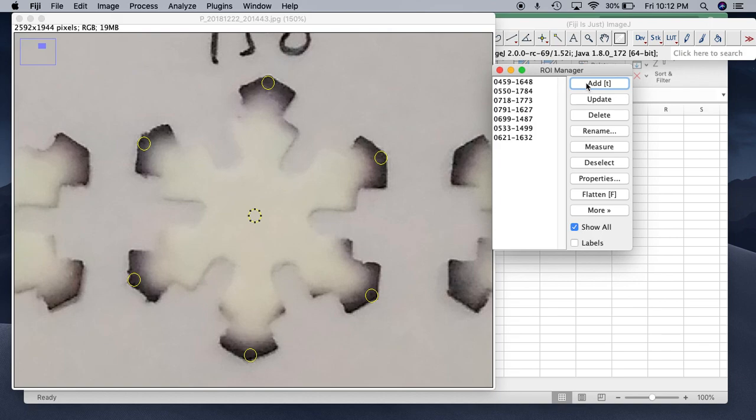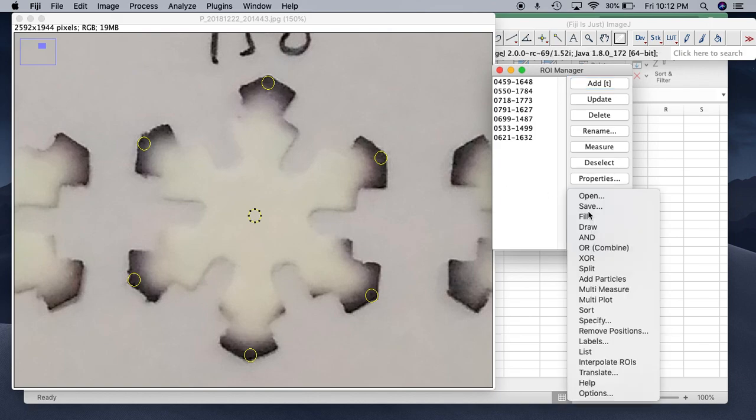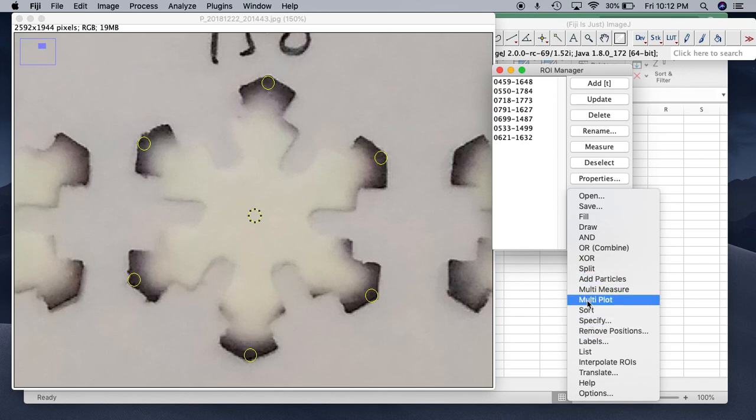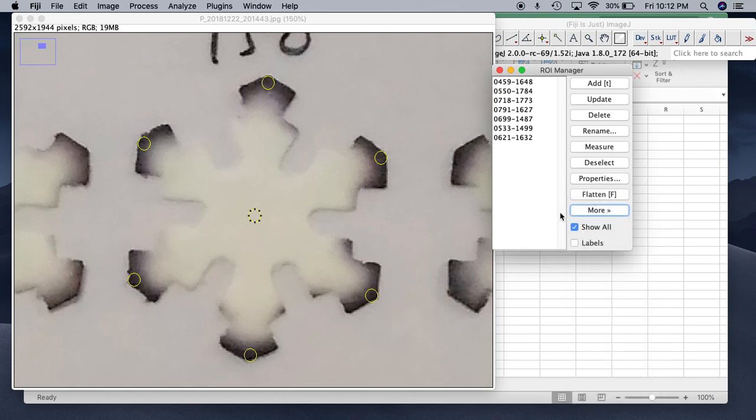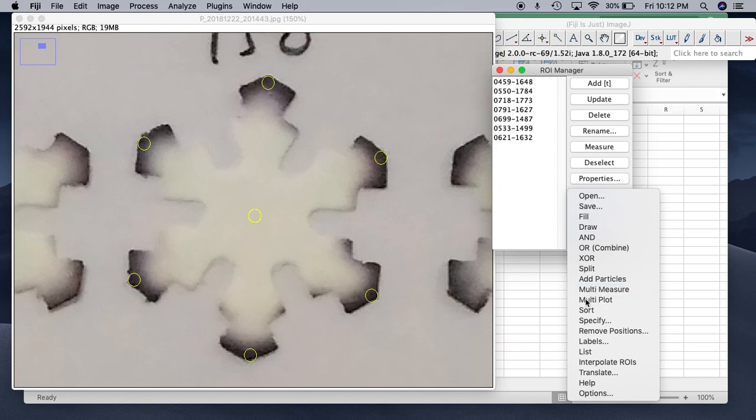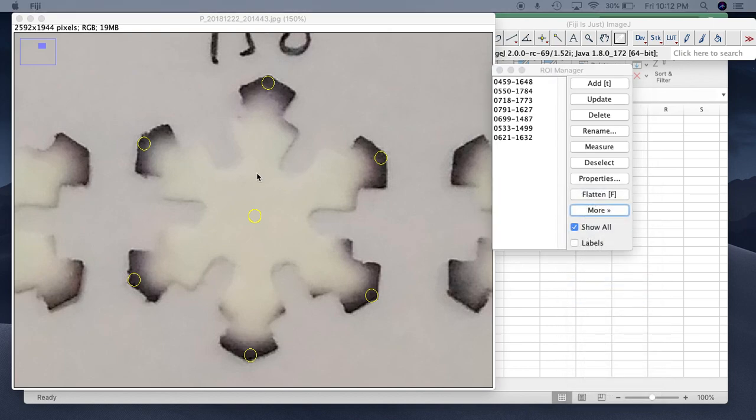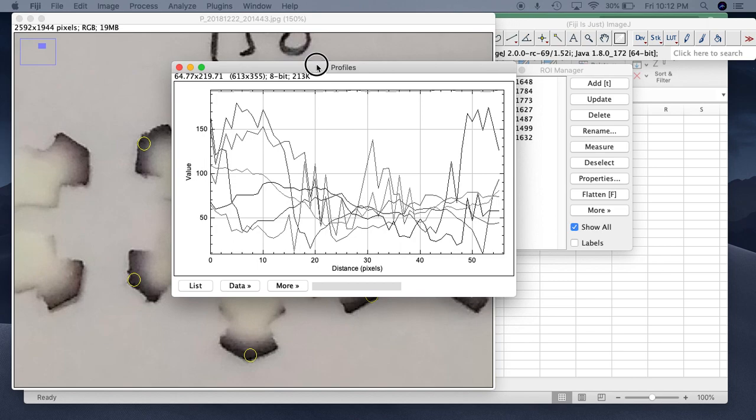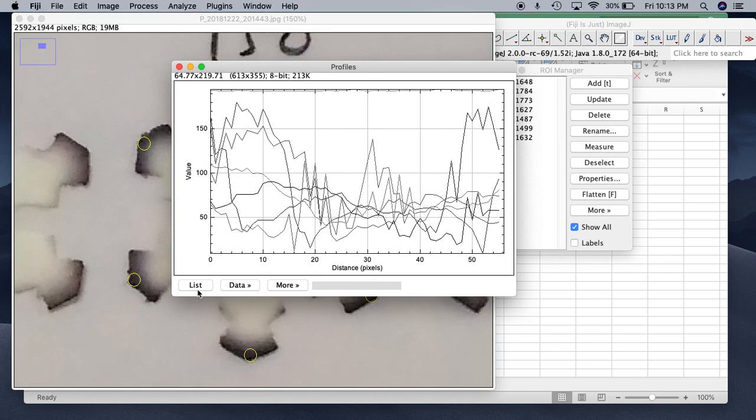So let's add this one. Now we have four coordinates. Let's try to plot their data. Now we use, we just go to, click multi-plot again. We'll get profile data like this. I'll try to list all the coordinates.